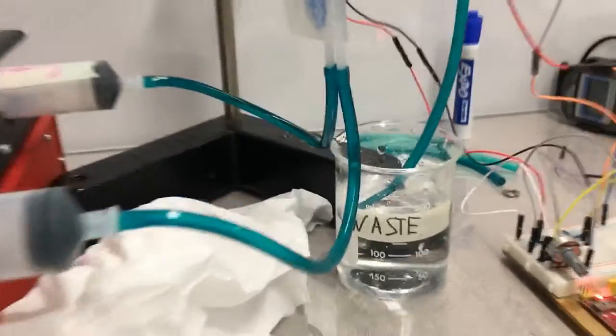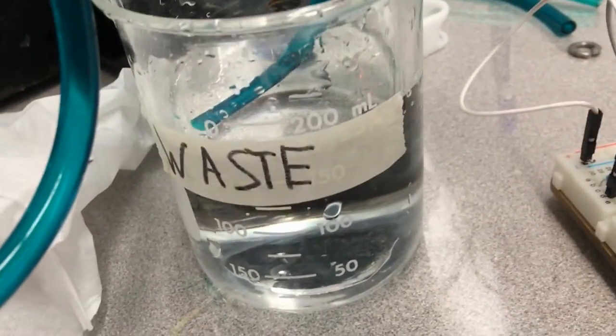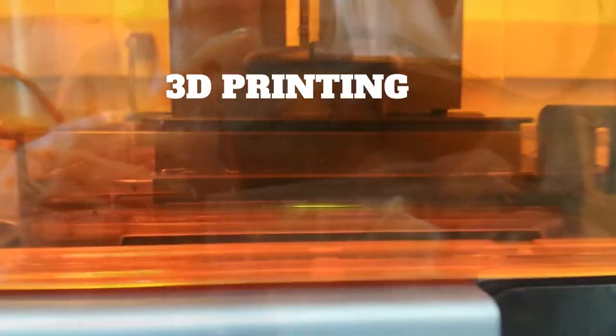Okay, so now we are pumping, this is DI water in our waste container, and we are pumping it back through the reactor to clear the reactor, get all the bubbles out. It's gonna run into these, we can clean them out, and then refill them. Just wait a second. Okay.